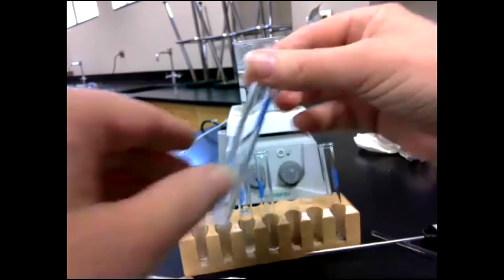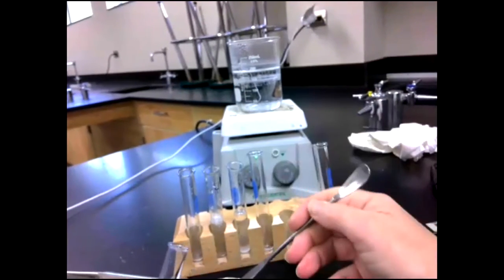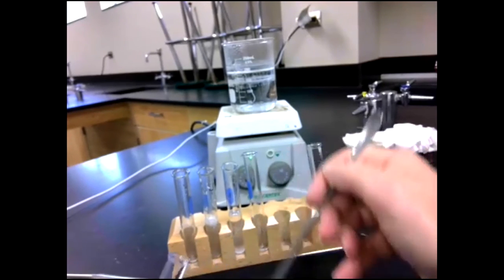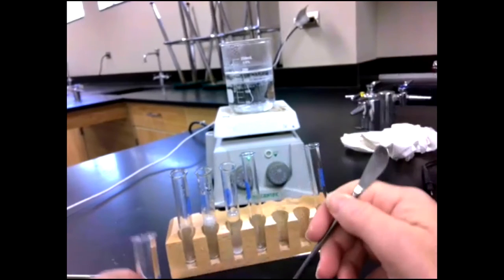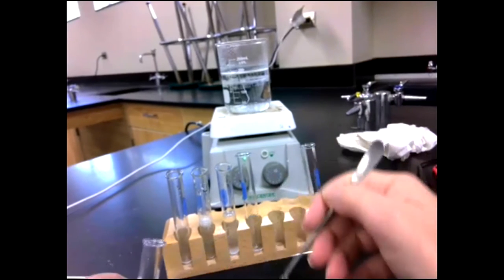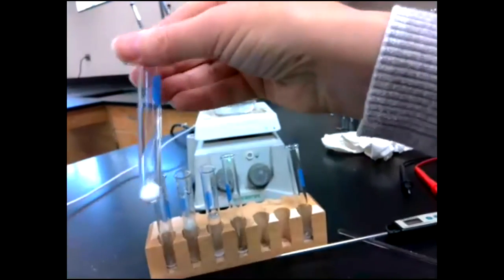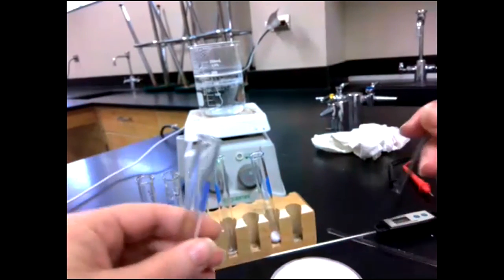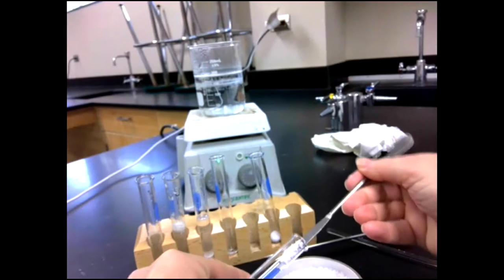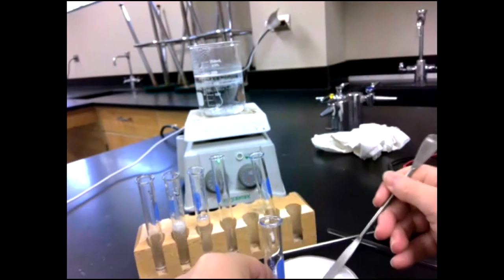So A, again, is going to go on the left. I'm going to do quite a bit here so that it's easy to see on the camera. I think in the instructions it says to use a small amount, but I'm the only one doing it, so it's okay. I'm not using up very much stuff. So that's A, and it's definitely a solid, and it's almost boiling. And then B, I'm going to put B in here. B is really fluffy, so it's going to look like a lot, but it's actually not.